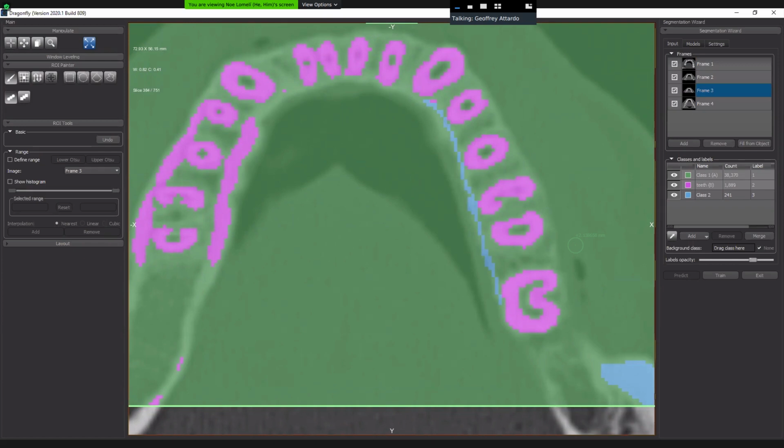So we could do a detailed breakdown of like 5 slices and then use those for training. Yes, of every organ that's in a particular slice. I think what you did is very feasible for deep learning, like 5 or 6 classes. What you need is very good training frames, very well segmented, prepared, very accurate training frames. The resampling did work, and I've selected 3 slices and annotated them.